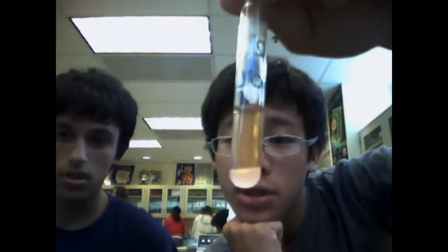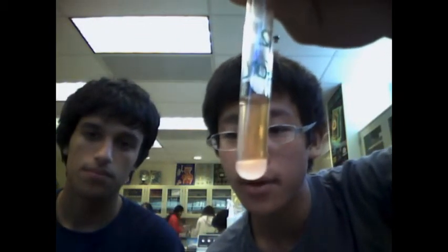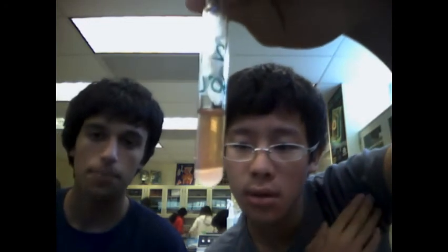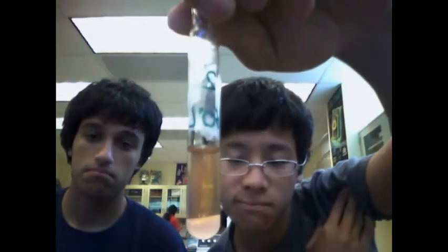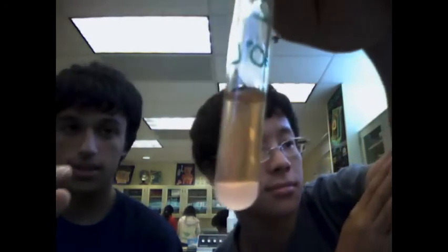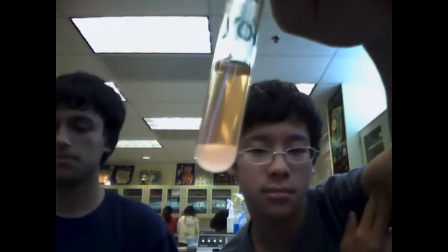At higher temperatures, the cellular debris tends to coagulate, and that is what the white stuff at the bottom is. To get the potato extract that we use for the catechol oxidase enzyme, we took a potato and blended it. Mashed potatoes. Yummy. So we see that this has been denatured by the heat, showing that it didn't have as much of a reaction.